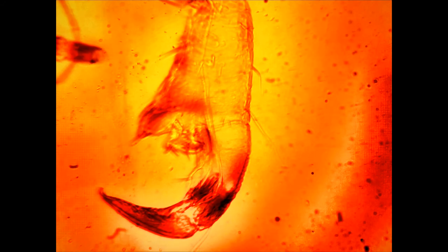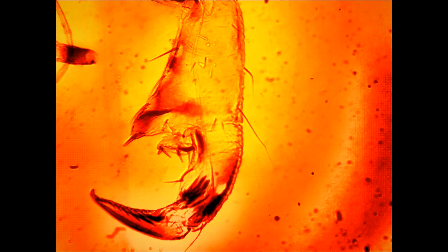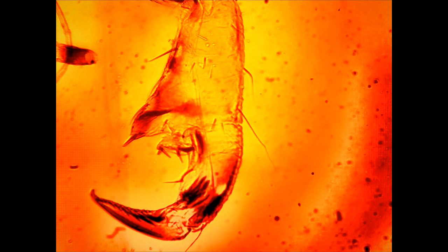This is why microscopists of that era mounted the objects on needle points or in stage forceps, so they could be maneuvered into place under their extremely high-powered and short focus lenses.